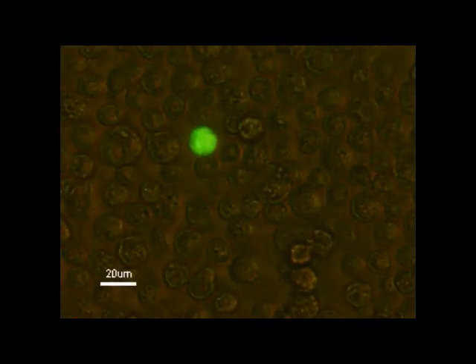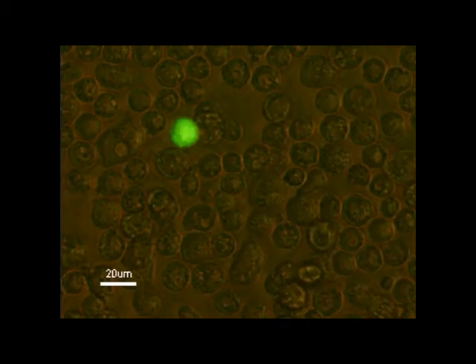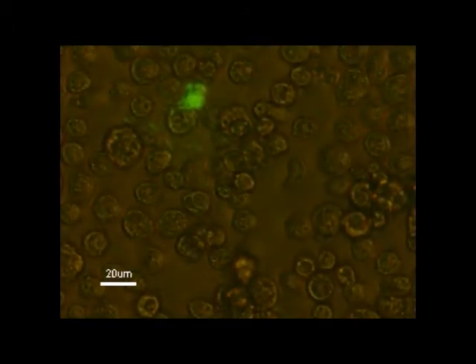and it'll help explain this whole situation. What you're looking at right now, see that green spot? That is an infected amoeba that just lysed.